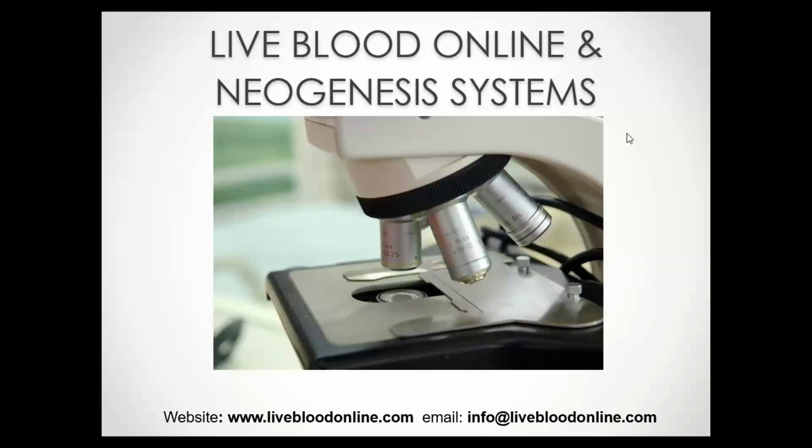And what are the risks of the procedure? Well, since we are working with blood, there are some risks to yourself and to your clients. However, the risks are minimal, because it really is just a drop of blood taken from a finger prick. And these risks are very easily mitigated with some simple measures. We do cover this in detail in the course, but essentially it involves using disposable gloves, new sterile lancets, and of course disposing of the used sharps correctly.